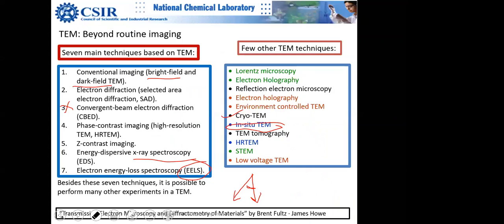Thank you. So you asked the question, right? I think the student was asking what in situ TEM is for. I think the question came because I said Nobel Prize, otherwise the question wouldn't come. In situ TEM, I had arranged one lecture at NCL. Many people attended and learned it. So in situ TEM is the next thing which is going to contribute big in chemistry. Here in situ TEM means you are carrying out the reaction inside the tiny sample holder of the TEM, and you're applying high pressure, high temperature, whatever conditions you want. So you are looking at the formation of inorganic matter in real time. That is in situ TEM. Okay, any question?